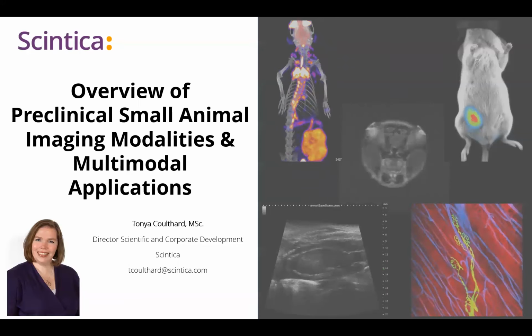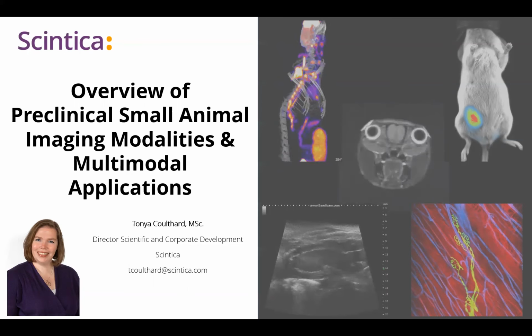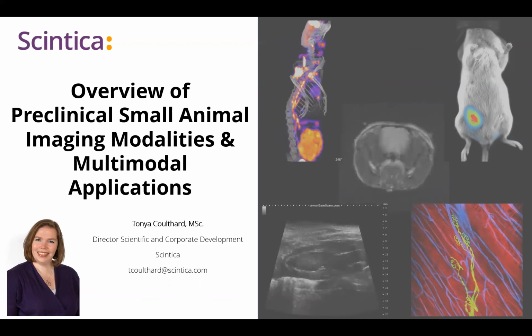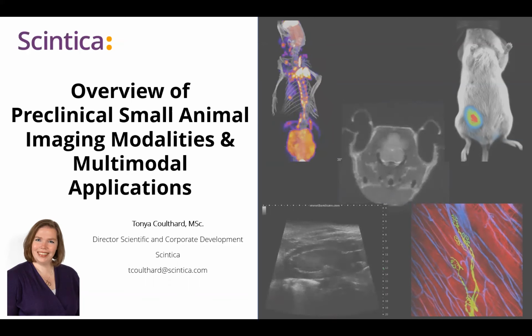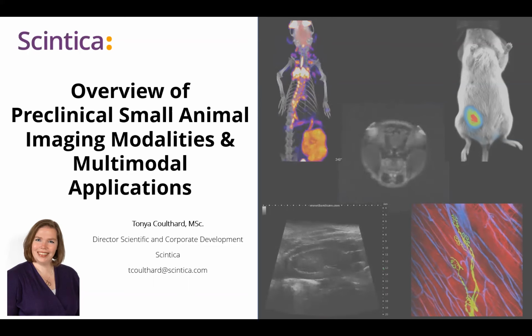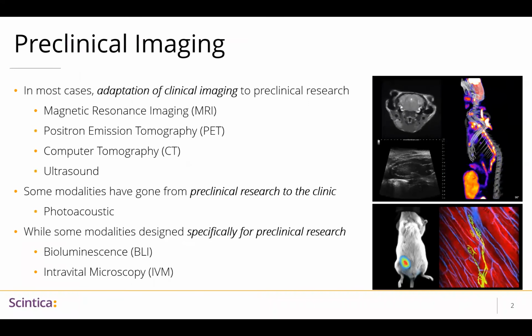So as Gabrielle mentioned, today I hope to review some of the small animal preclinical imaging modalities that we represent here at Scintica. The focus will be on the modalities and less on the products themselves. And then we'll spend a bit of time talking about multimodal imaging, the importance of it, and review some papers that use multimodal imaging techniques.